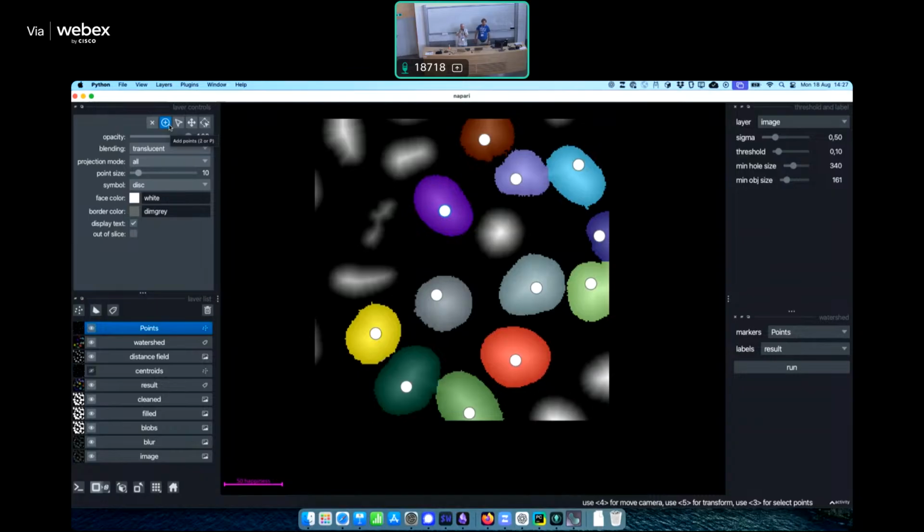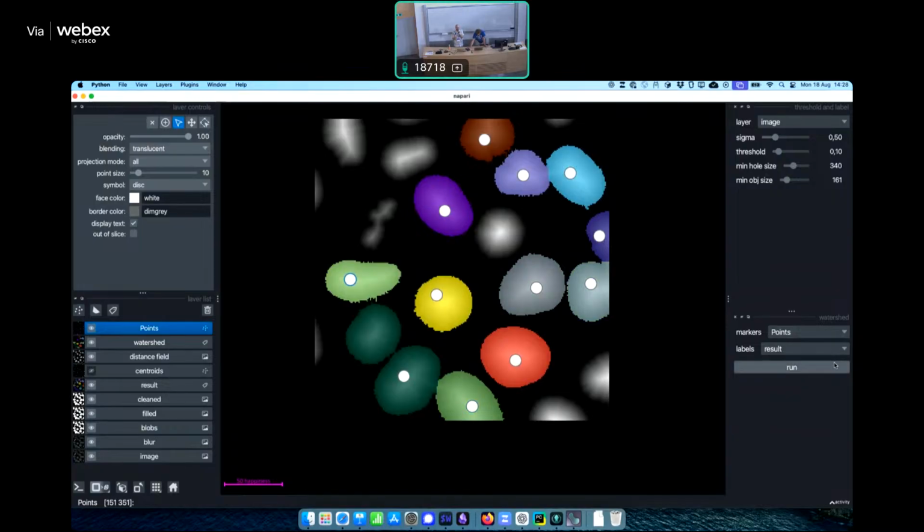Yeah, you have to change mode. The buttons at the top of each layer control panel are the layer mode. So you can change to select mode, create mode, remove mode, and so on. This obviously I should have explained earlier and I forgot. This is also what I did earlier when I was deleting or creating a new label. It was the same idea. And as you can see, you can select points and drag them around. You can also select a group and then delete them. It's going to interact more or less the way that you expect from image editing software.